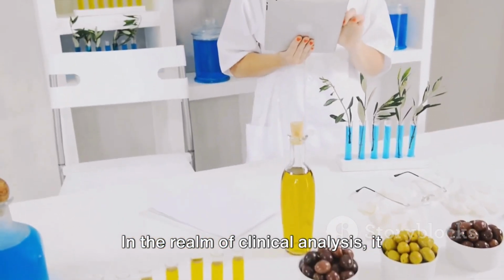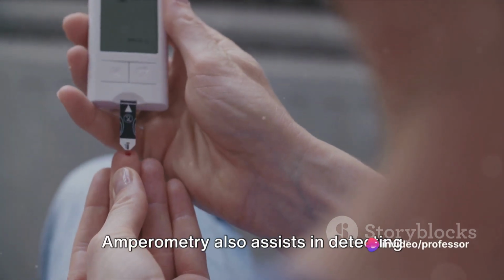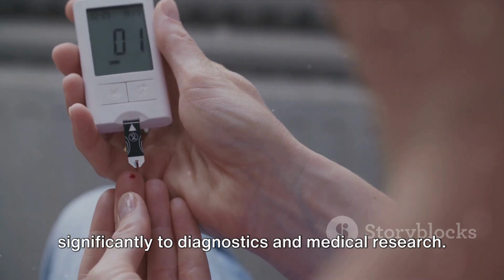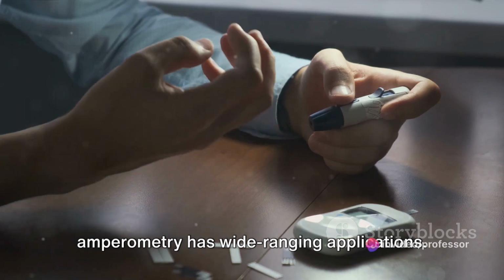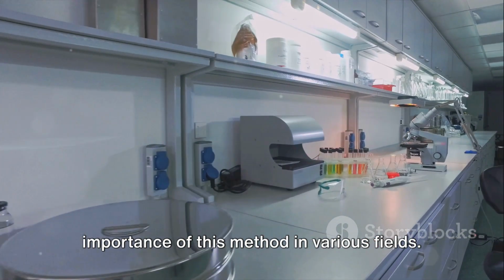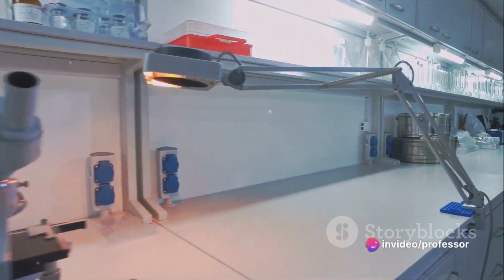In the realm of clinical analysis, it shines brightly. It's used in glucose meters, a crucial tool for managing diabetes. Amperometry also assists in detecting other biomolecules such as cholesterol or lactate in blood samples, contributing significantly to diagnostics and medical research. From ensuring the water we drink is safe to keeping a check on our health, amperometry has wide-ranging applications. It's a testament to the versatility and importance of this method in various fields. Despite its limitations, amperometry's wide range of applications make it an indispensable tool in analytical chemistry.